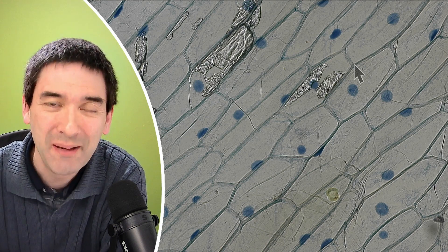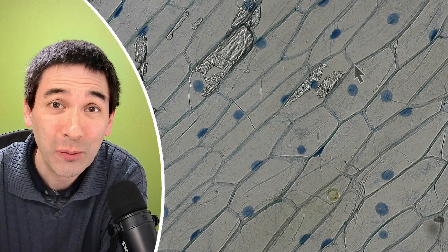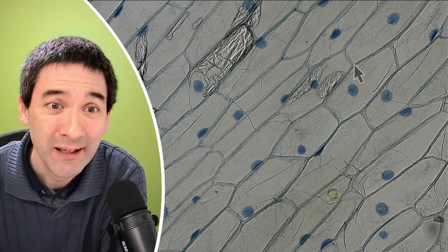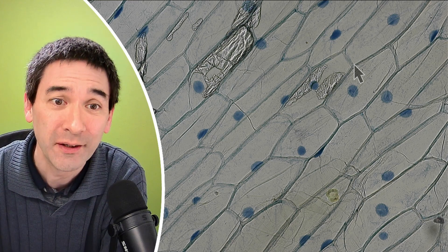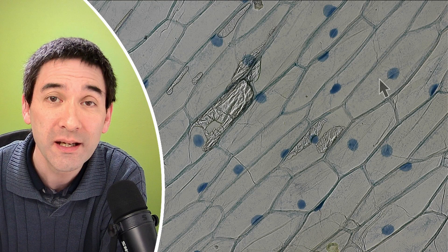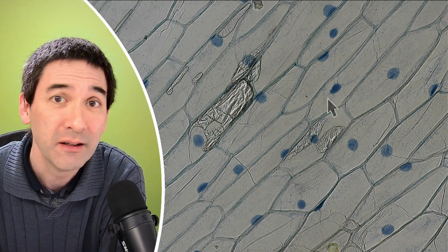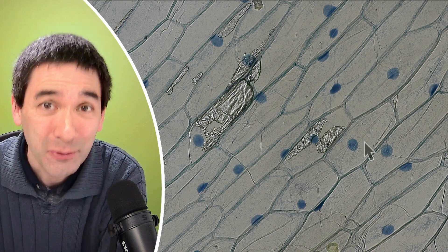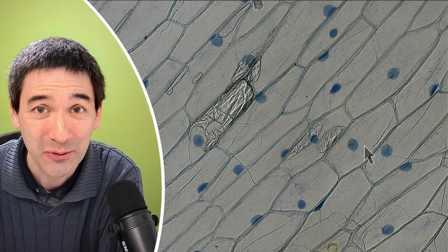Hi, hello and welcome again. Microbe hunter here. Some cells under the microscope do not seem to have any nuclei, unlike the one that we have over here. That's an onion skin under the microscope and you can see that each cell has a nucleus. I stained it blue and it's basically as we expected. However, under the microscope, sometimes you're not able to see those and there are several reasons for this. And today in this video, I would like to talk a little bit about that.